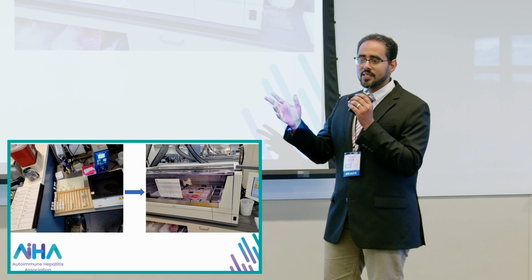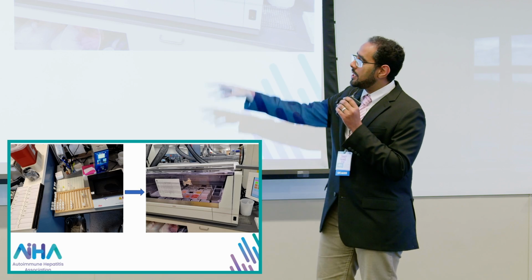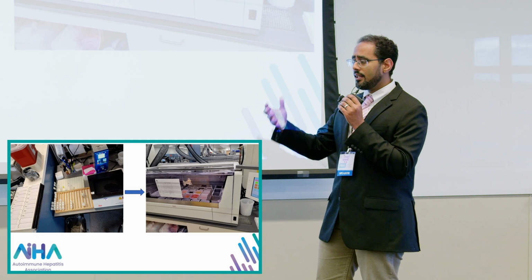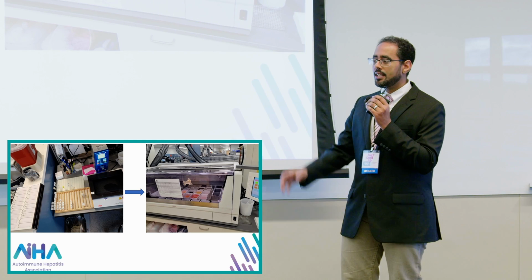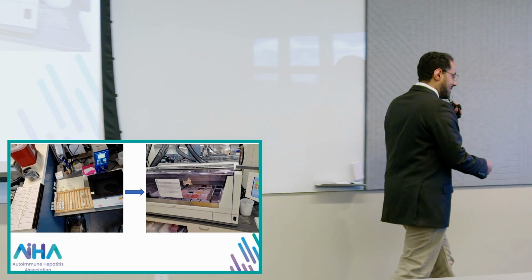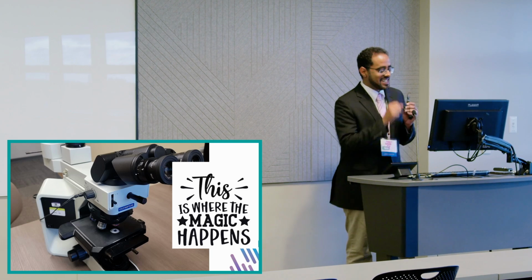So then someone else, also smart, decided to put some dyes in and color it up. The slides go into this machine that puts the dyes in, a pink one and a purple one. We call them hematoxylin and eosin, and that gives the colors. And then the slides get to my desk, and that's of course where the magic happens.